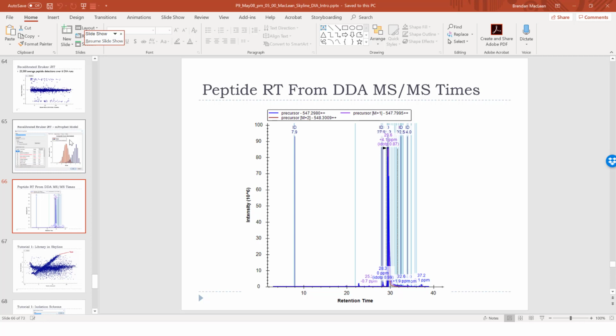And you can see that there are lines here. If you use a mean, you're going to end up somewhere over here and say, oh, the peak's right there. That was what I did at first: I calculated all the times that I saw and used the mean time, thinking, well, if it's a distribution, the mean will be pretty good. But the problem is that you get two IDs here and here, and you'll say, oh, the peak is here, which is nowhere near any sort of peak. So I switched to median, but still you can get better iRTs if you actually go get peaks.